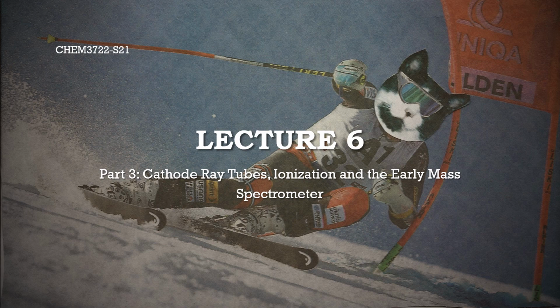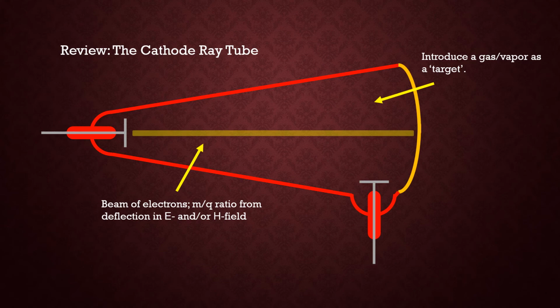This is lecture 6, part 3, and I'm going to modify the cathode ray tube to look at things bigger than the electron, describe how ionization occurs and how the resultant ions can be analyzed, and then I'm going to describe the principles of mass spectrometry. So again, just to review, we have the basic cathode ray tube, which creates a beam of electrons that can hit a target. In other words, they're ballistic.